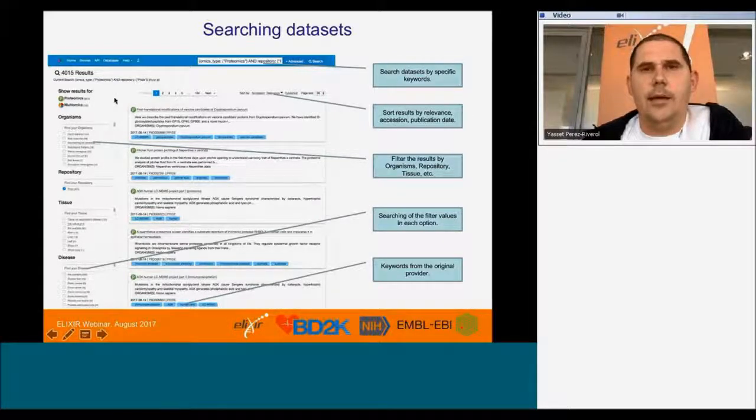provided by OmicsDI that enables you to filter and refine your query. Let's say you can search here for a couple of keywords, like, for example, proteomics, or you want to study, for example, cancer, and so on.